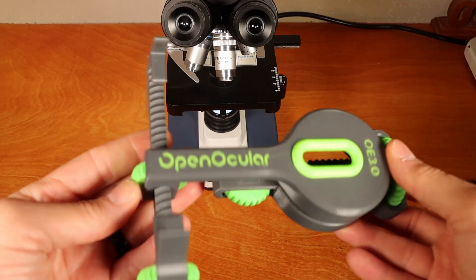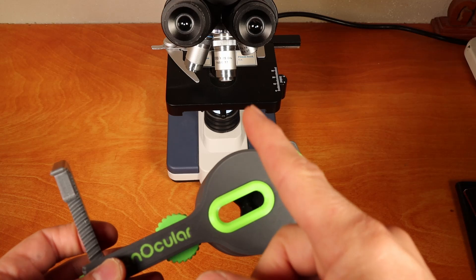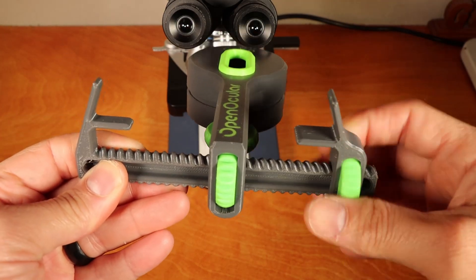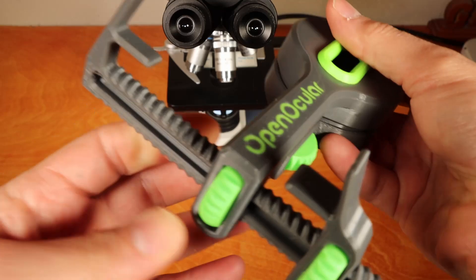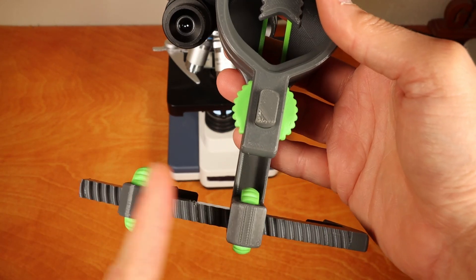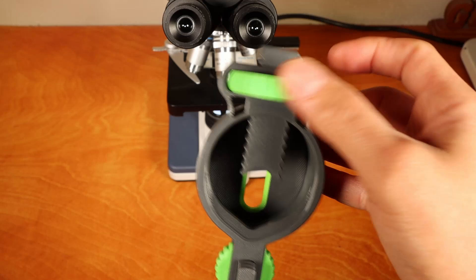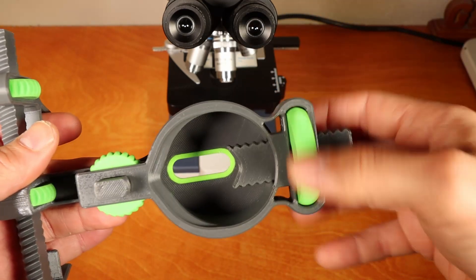This adapter will connect and align any smartphone camera to your eyepiece, whether that's a telescope or a microscope. The smartphone clamp tightens onto your smartphone. The X-adjustment knob moves in this direction so that you can align your adapter to the camera itself. The eyepiece clamp knob clamps onto your eyepiece and tightens it.